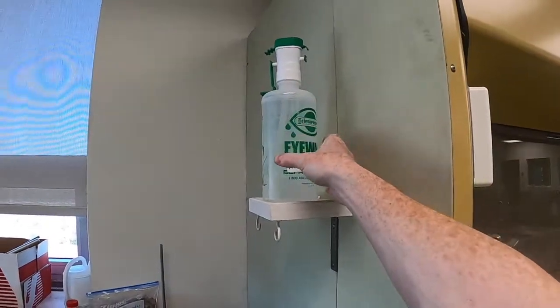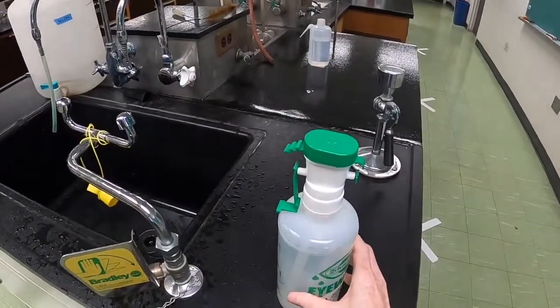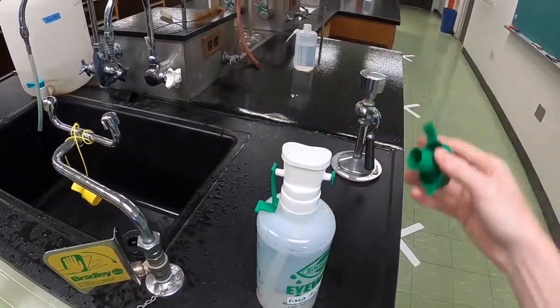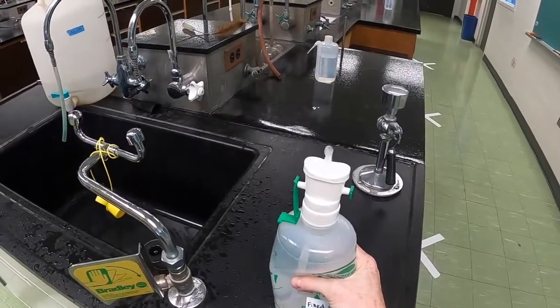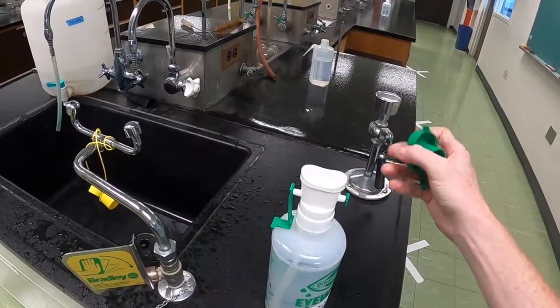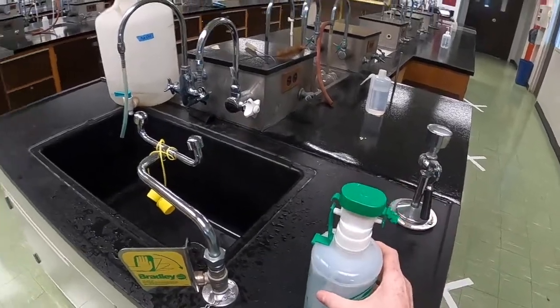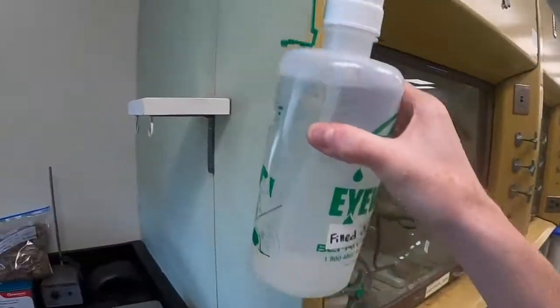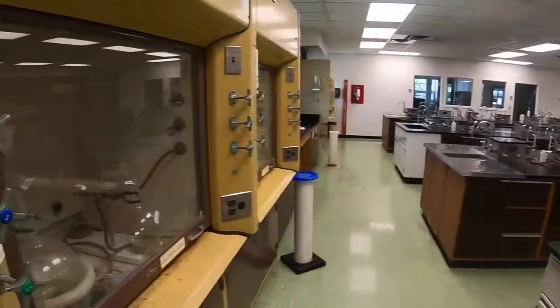Using a portable eyewash is also pretty straightforward. You take the bottle down and remove the cap. Once that's done, you simply hold your eye open with your hand, lower your eye to the cup on the top of the bottle, and squeeze the bottle repeatedly. The good part about the portable eyewashes is that they are portable, so in the event of an emergency where we have to evacuate, you can bring the bottle with you and continue to rinse your eyes even as we leave the room.